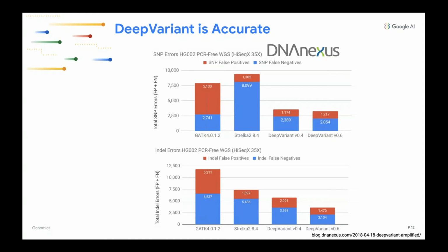I should finally point out that these accuracy numbers are based on the Genome in a Bottle gold truth set, and they're based on the confident regions. I'll show you some data later on, which also demonstrates how PacBio can even extend beyond these regions effectively.